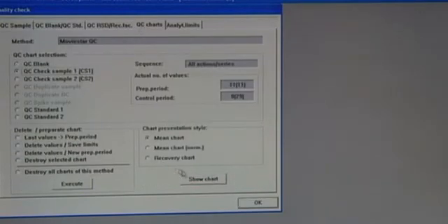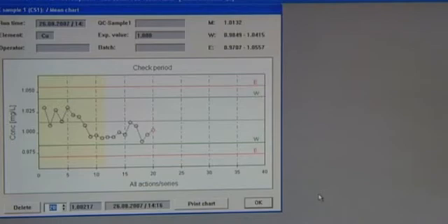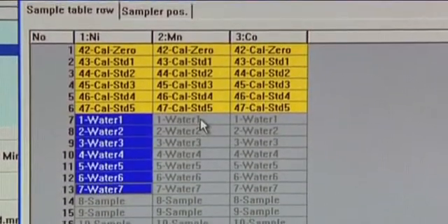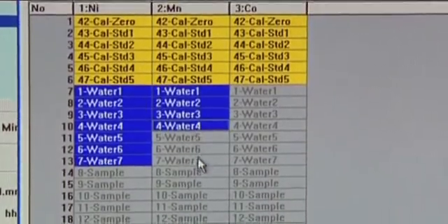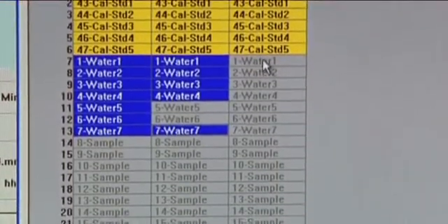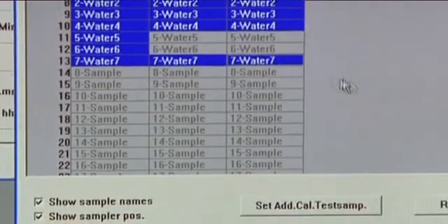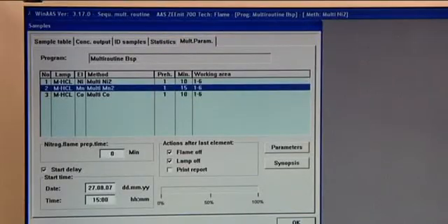Individual element methods for a sequential multi-element routine can be combined for determining several elements in one series of samples. With that, the desired elements are processed fully automatically, one after the other. Since the next lamp is already preheated, there is no waiting time when changing from one element to the next.